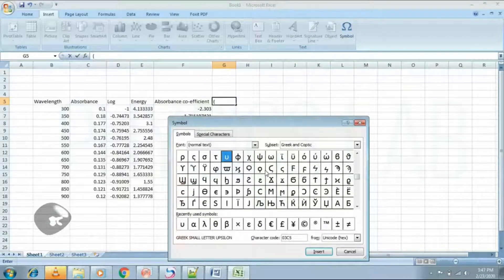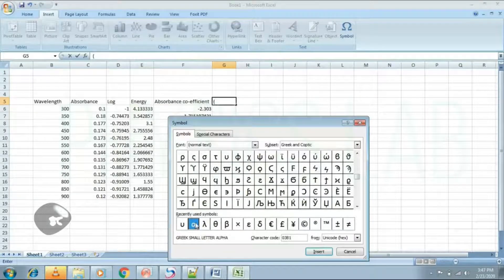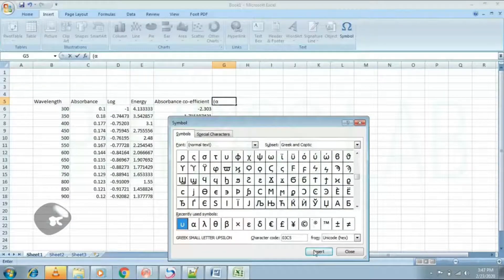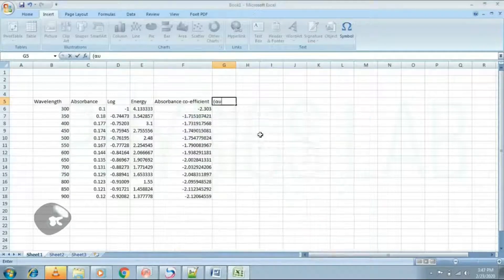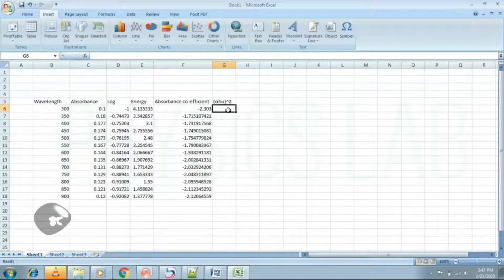Step 4: We draw a plot between hν and (αhν)². Here H is Planck's constant and mu is the frequency.